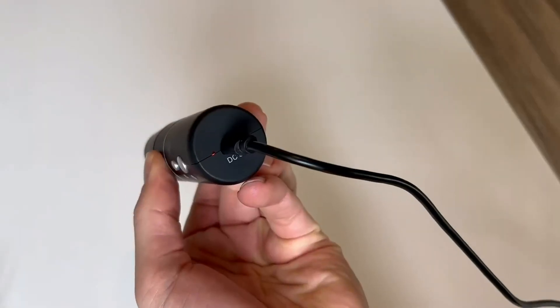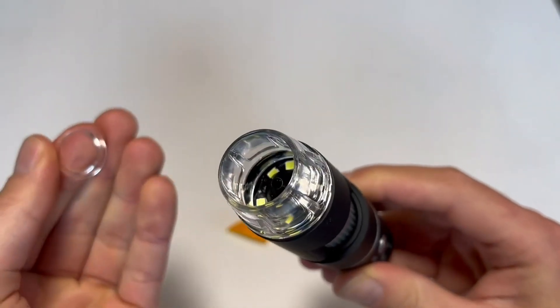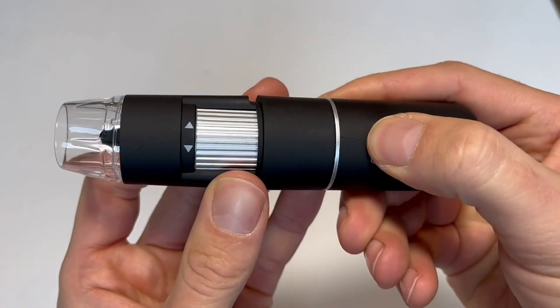It also doesn't come with any batteries and doesn't need batteries — it is rechargeable. You can see when you plug it in, it has that red light, and it also has a protective cover that covers the lens that is looking down.